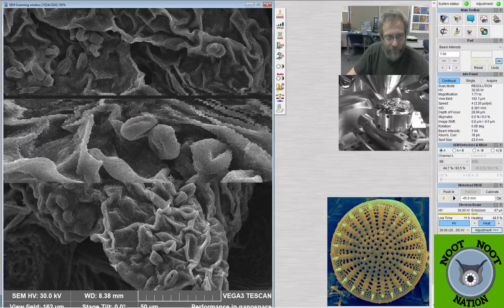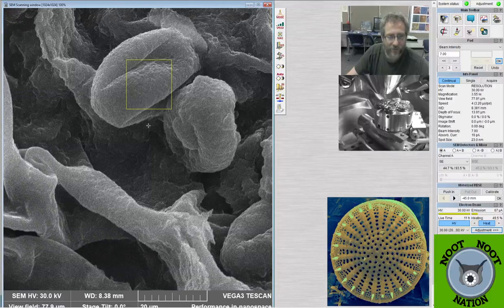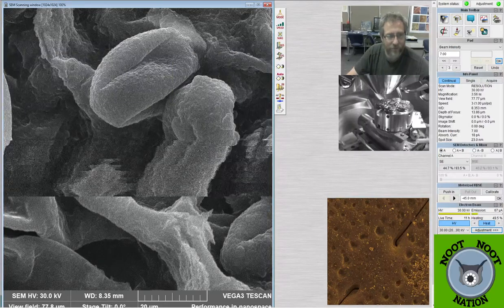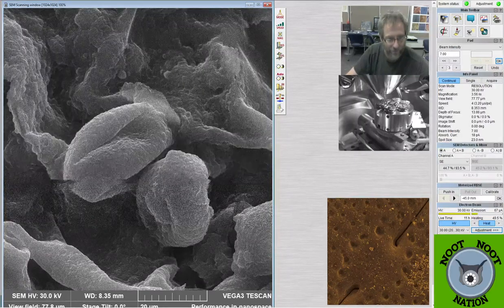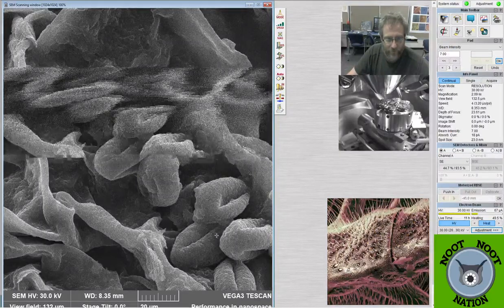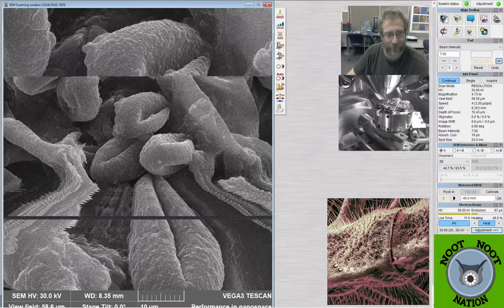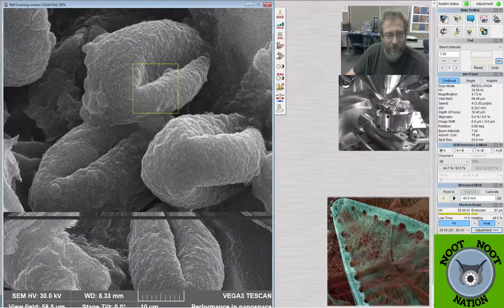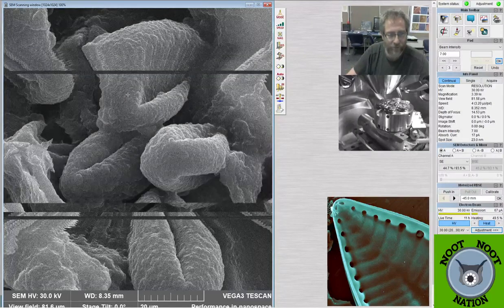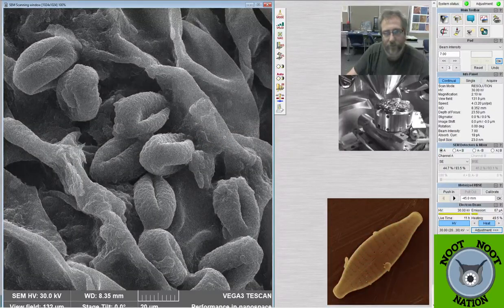So let's zoom in and take a look at it. Yeah, it definitely doesn't have the fingerprint swirls. So this is either the locust or the oak. I think we had somebody who knew pollen here earlier. I don't know if they're still in the channel. But I feel like we have enough good views that you ought to be able to figure it out, even if you're not an expert at pollen, just by using Google, if there are SEM images of this stuff, that is. Good. It looks good.